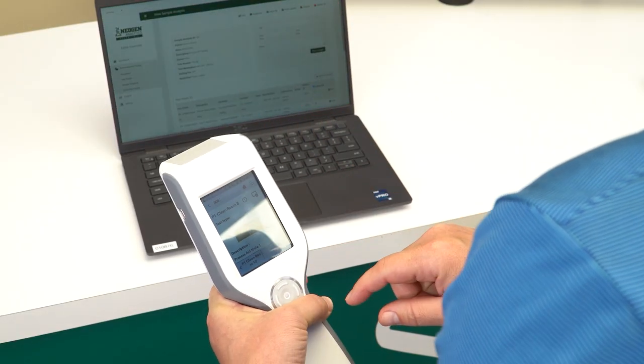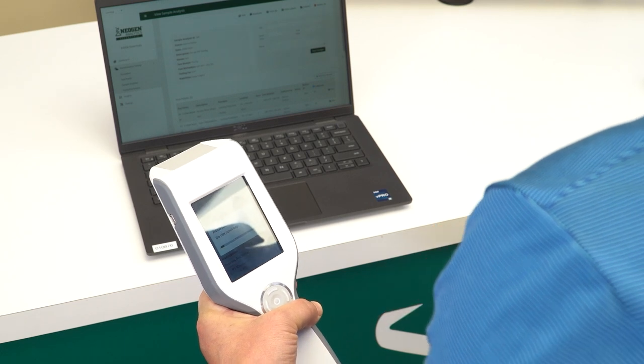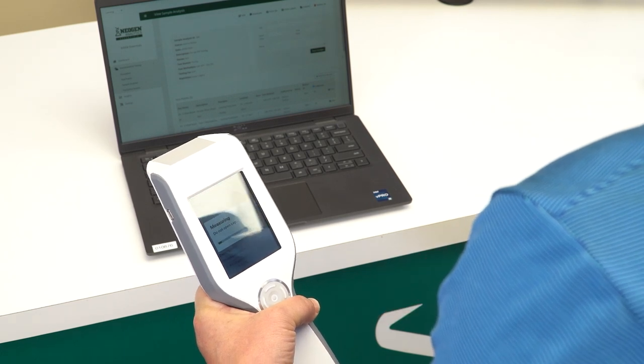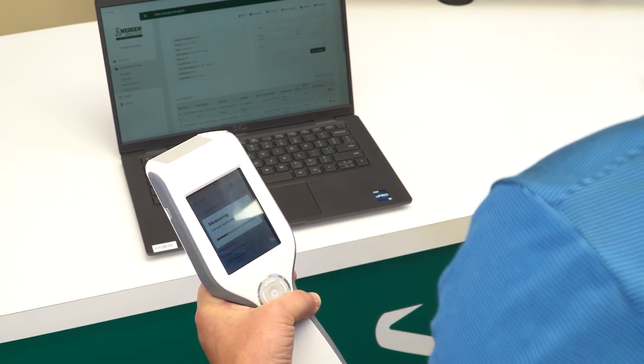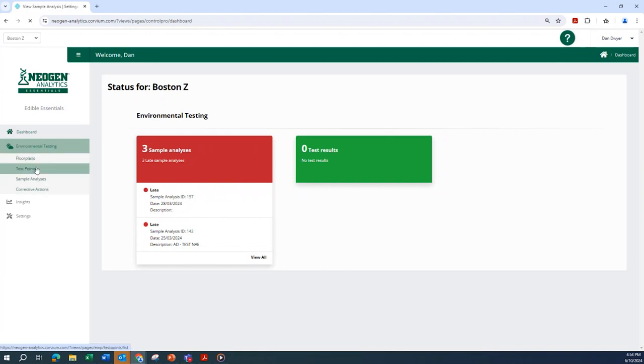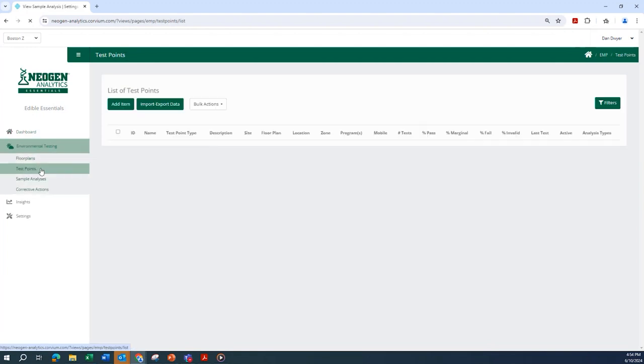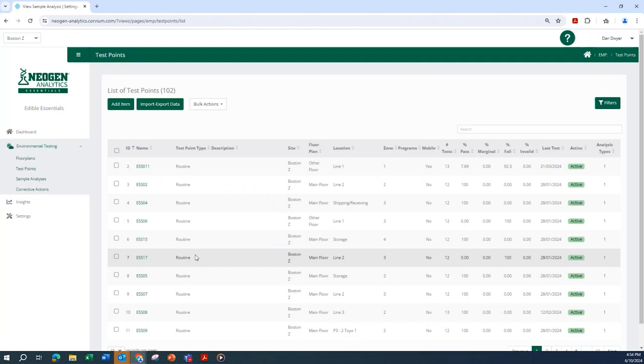Once the LM1 is synced with Neogen Analytics, your testing results will be available in the application. Navigate to Test Points and select the test point of interest to see testing results, historical testing performance, and related information.